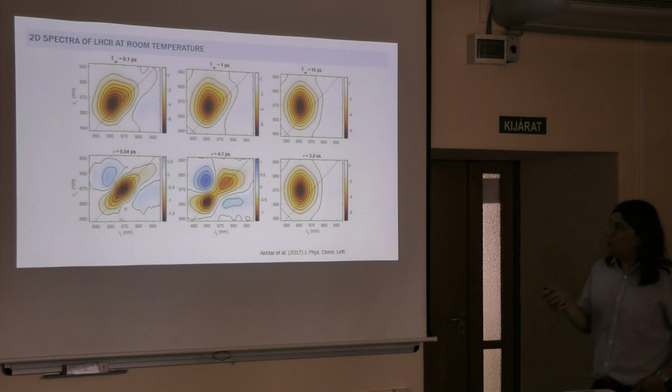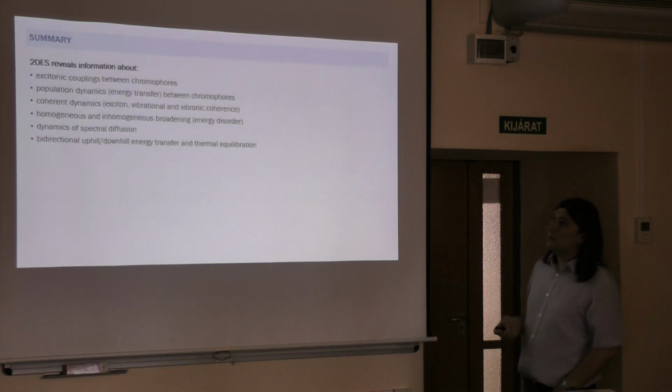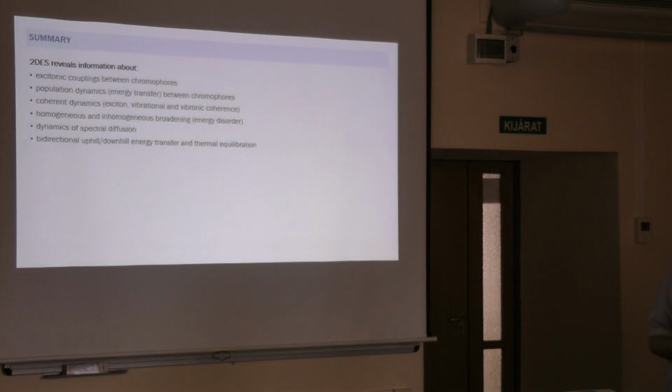Of course, the way to do it is to excite the same and detect the same states. We can do that, obviously. And so this is the experiment in the chlorophyll A domain. That is at room temperature, but again, there is not much resolution. If you want better resolution, usually you lower the temperature. So that's all I have as slides.